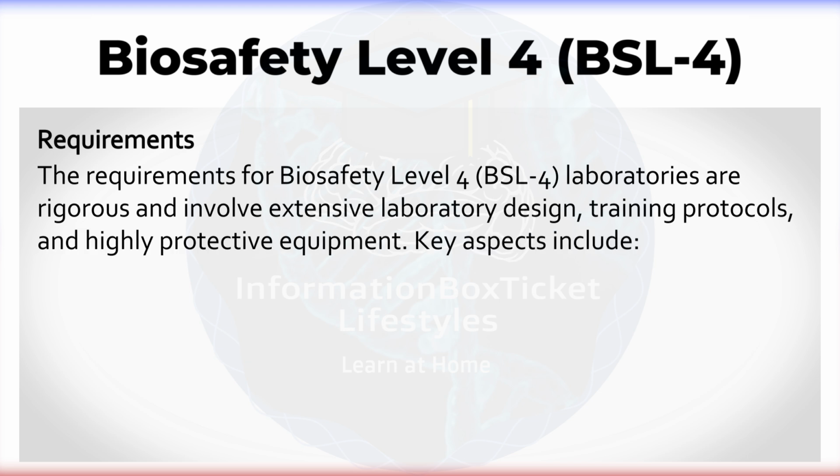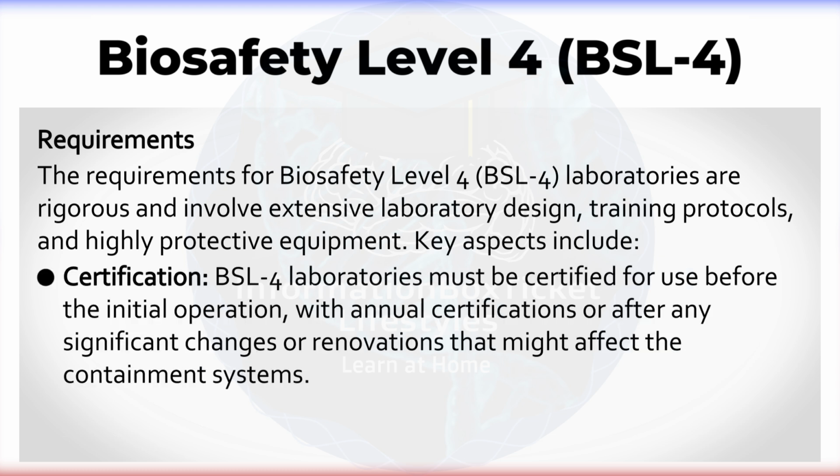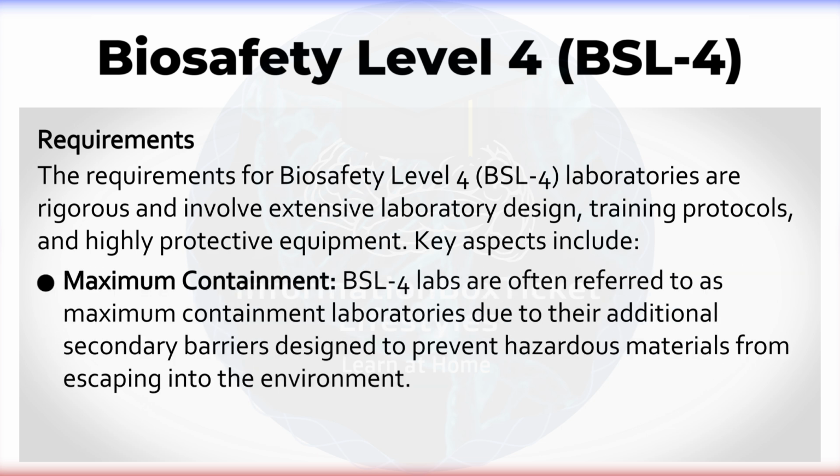Requirements. The requirements for Biosafety Level 4 laboratories are rigorous and involve extensive laboratory design, training protocols, and highly protective equipment. Key aspects include certification. BSL-4 laboratories must be certified for use before the initial operation, with annual certifications or after any significant changes or renovations that might affect the containment systems. Maximum containment.